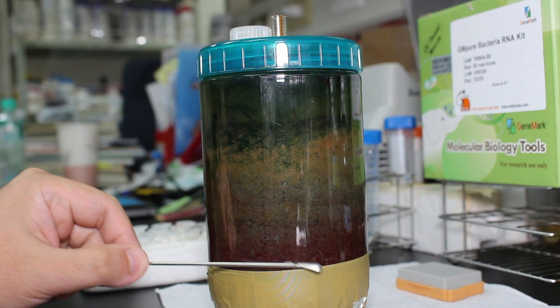It's about like a week and I can already see the bacteria, I mean the color, with my naked eye. These layers of color, it's like a huge apartment. And the bacteria, different bacteria is like the residents in that apartment.